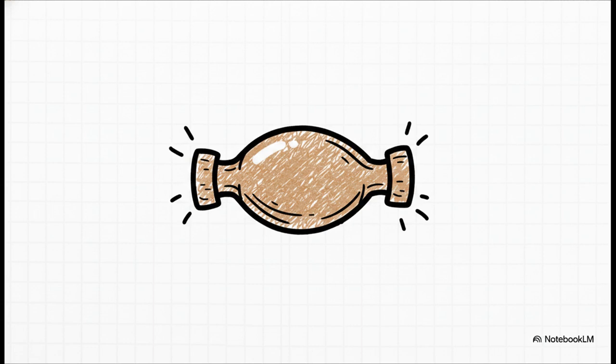You are specifically confirming a very distinct lemon or barrel shape. It's got a prominent brown color, and when you measure it, you're looking for dimensions of 80 micrometers by 42 micrometers. And of course, it's capped by those unmistakable extruded polar plugs that literally stick out like tiny little corks.